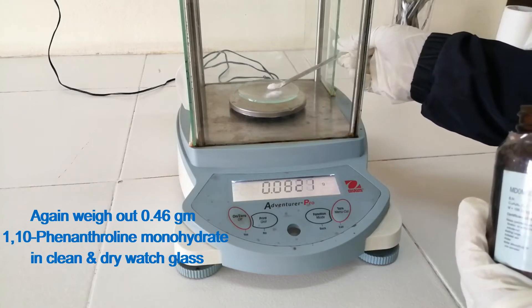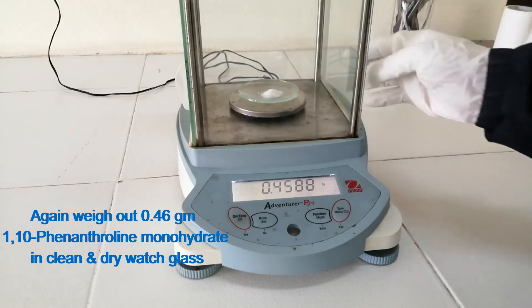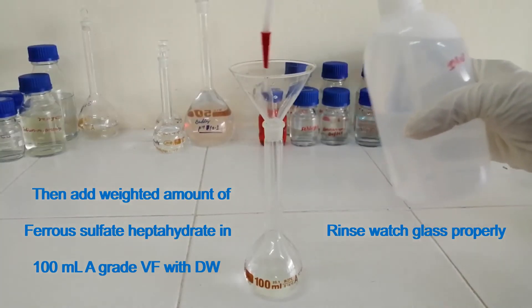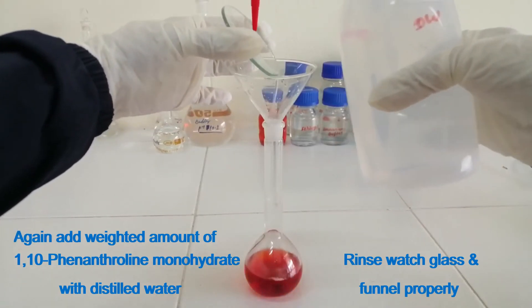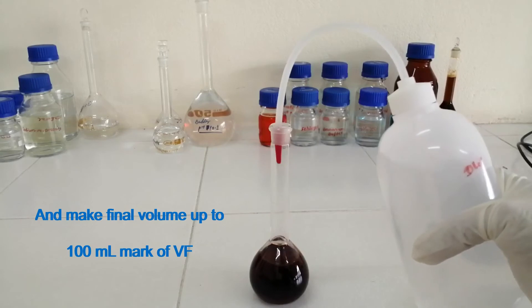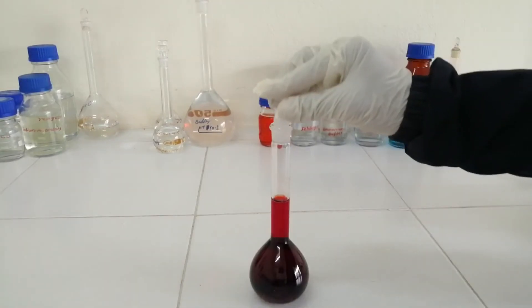Dissolve the ferrous sulfate in a 100 ml grade volumetric flask with distilled water. Rinse the watch glass properly. Add the weighed amount of 1,10-phenanthroline monohydrate with distilled water. Rinse the watch glass and funnel properly. Shake well and make the final volume up to the 100 ml mark of the volumetric flask.